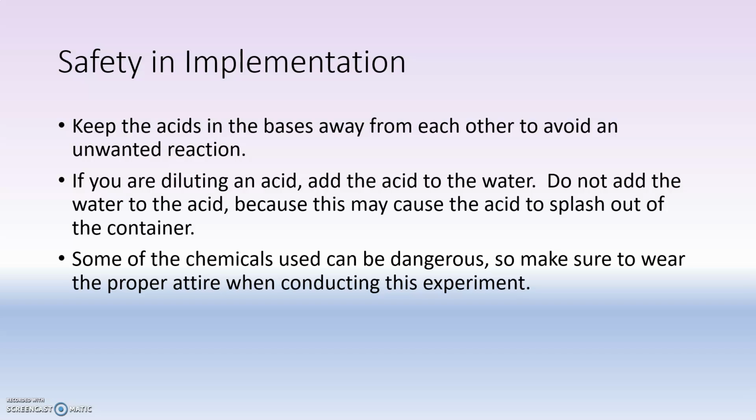For safety, you need to keep the acids and bases away from each other to prevent an unwanted reaction. And when you're diluting an acid, add the acid to the water. Do not add the water to the acid, because that may cause the acid to splash out of the container. Some of the chemicals used can be dangerous, so make sure to wear all the proper attire, lab coat, and goggles.